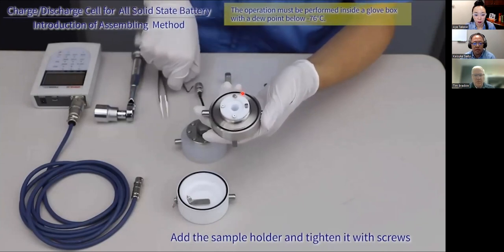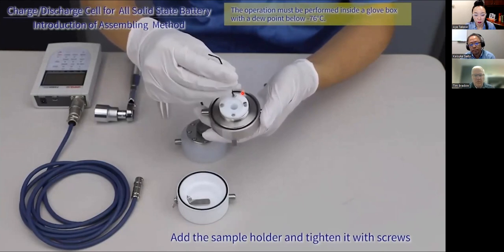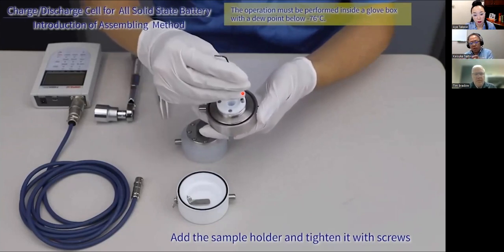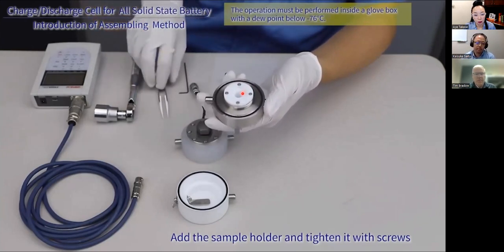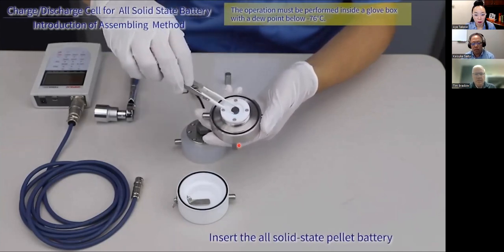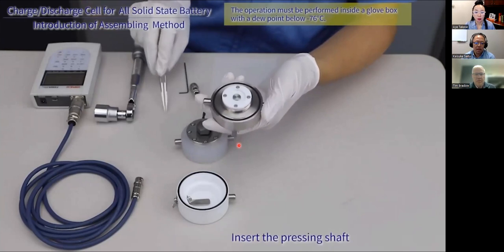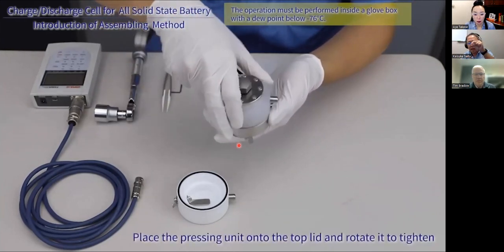And then we need to fix it. Once you fix the sample holder, this is also insulated material. So we are going to place your pellet solid state battery. Yep, so this is the battery itself. Then we put a pressing shaft, and then we put a lid with a very big bolt on it.